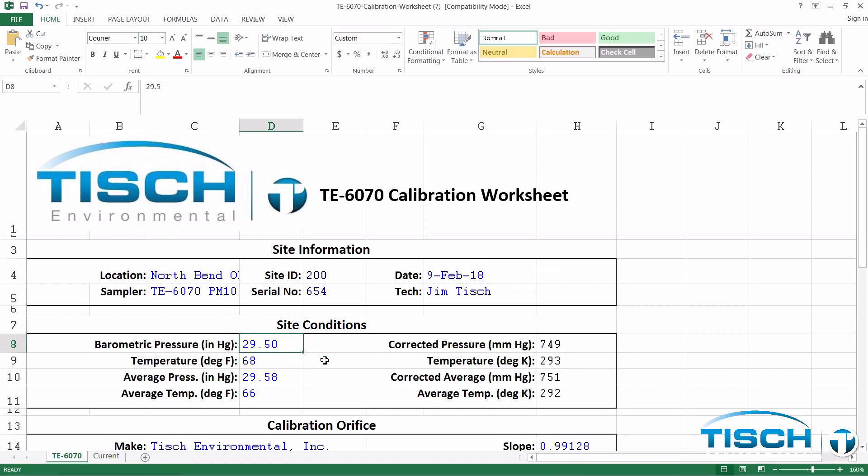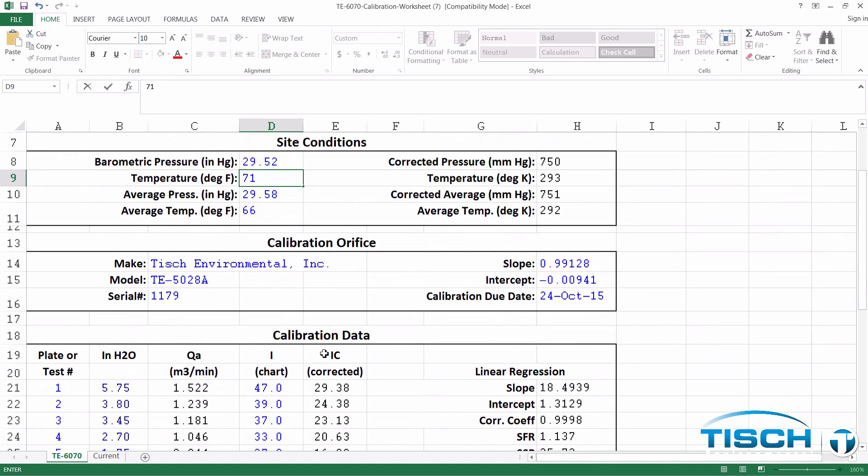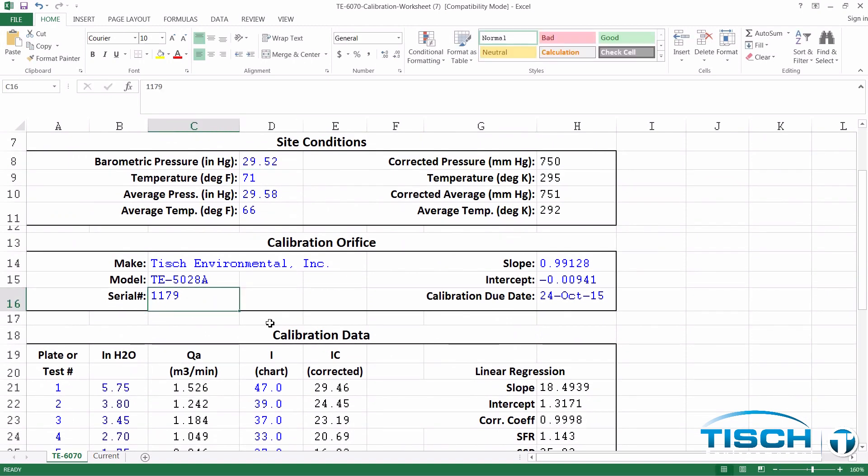Then you'll enter the barometric pressure in inches of mercury. In our example, it was 29.52 and our temperature was 71 degrees. Scroll down to Calibration Orifice and enter in your model and serial number. In our example, our serial number of our calibrator is 2870. Enter in the Q-actual slope and intercept from the calibration certificate. Our slope is 1.03680 and our intercept is negative 0.02696. You'll enter the calibrator's due date, which is February 9th of 2019.